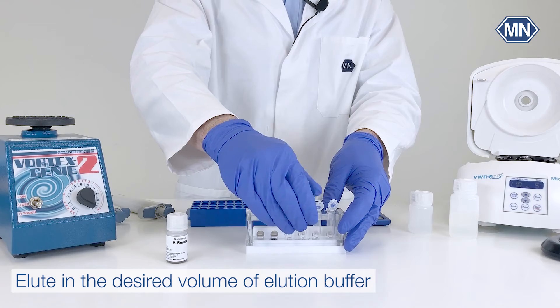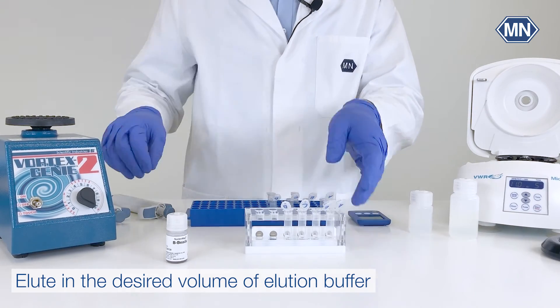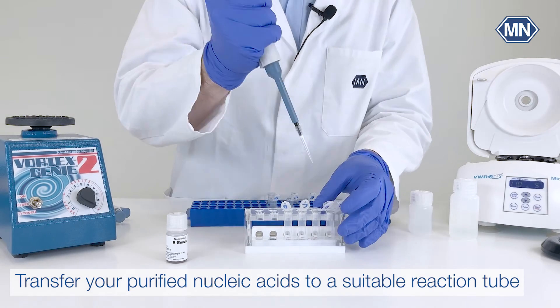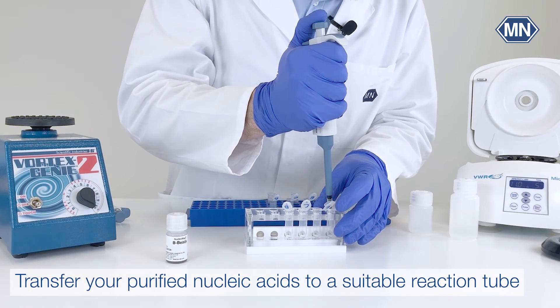Elute the nucleic acids in the desired volume of elution buffer. Finally, transfer the supernatant containing the purified nucleic acids to a suitable reaction tube.